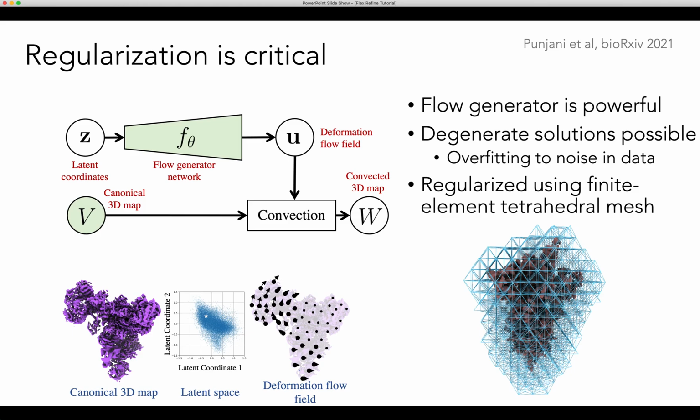So in order to fix this problem, we can actually adjust the mesh topology by having the mesh not enforce continuous deformation between the domains. Of course, now we need to instruct 3D Flex in the way of creating a custom mesh, or a custom mesh topology, as to which parts of the protein to allow to move separately and which parts should remain continuous and have their deformations remain continuous.